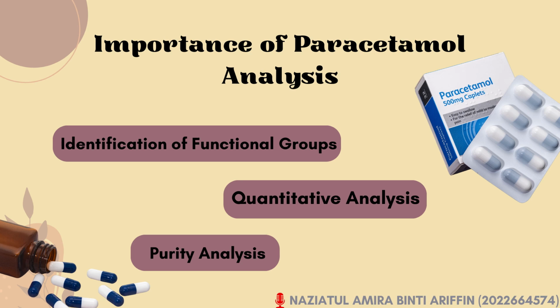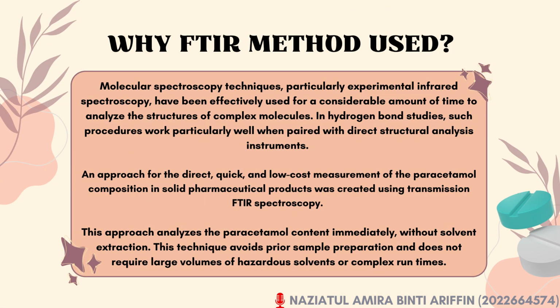And lastly, it is important for purity analysis. It helps in detecting impurities in paracetamol by comparing the spectrum of the sample to the spectrum of the pure paracetamol. Any additional peaks indicate the presence of impurities or contaminants. While the FTIR method is used, molecular spectroscopy techniques, particularly experimental infrared spectroscopy (IR), have been effectively used for a considerable amount of time in order to analyze the structures of complex molecules. In hydrogen bond studies, such procedures work particularly well and are paired with direct structural analysis instruments.